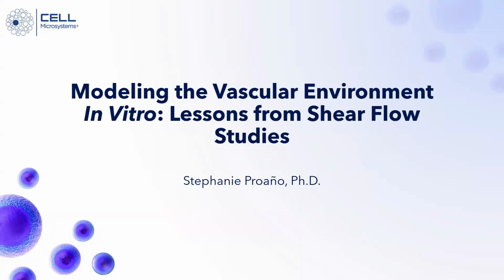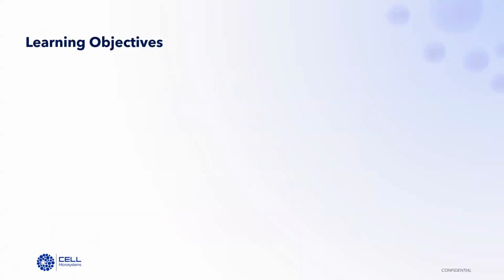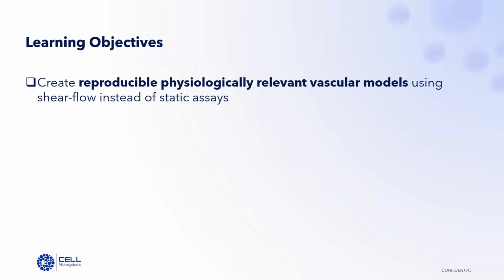I'm excited to walk you through how we can model the vascular environment in vitro, specifically how shear flow microfluidic systems help us study hemodynamics more accurately than static assays. By the end of this session, you'll learn how to build more physiologically relevant vascular models using shear flow.